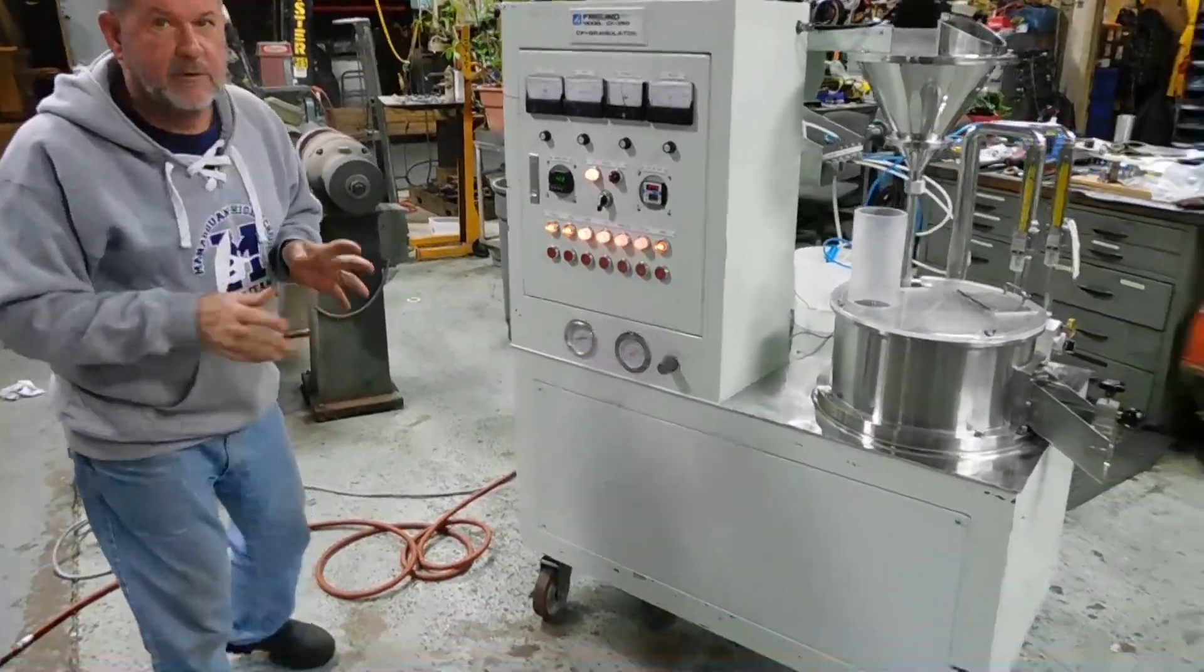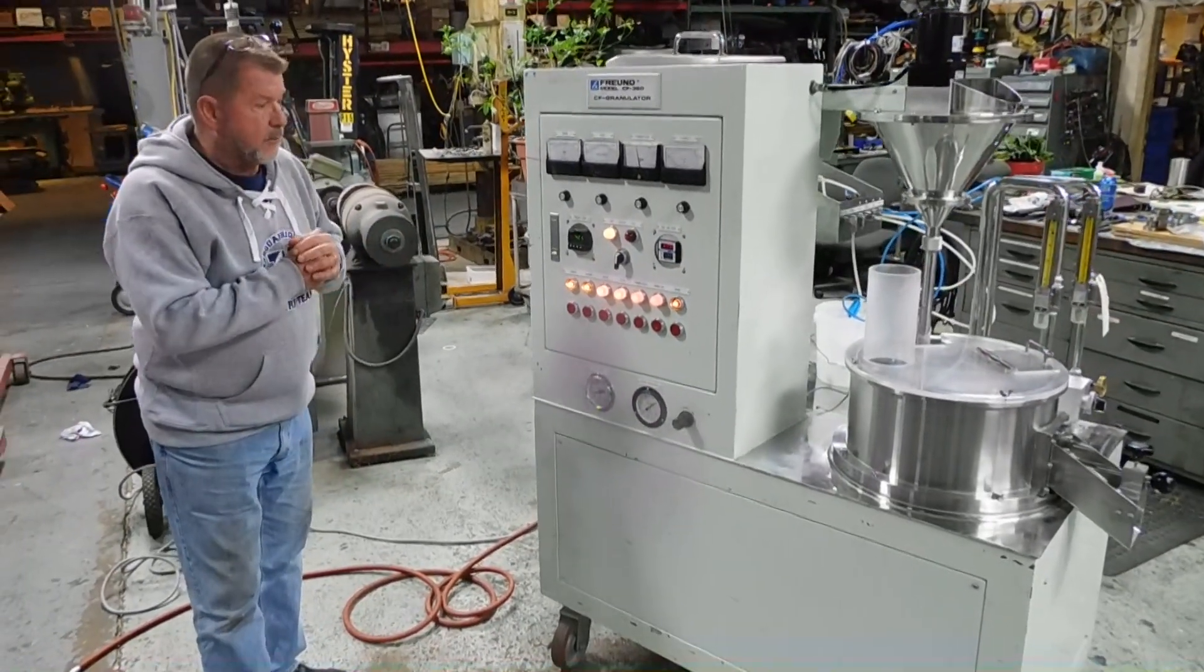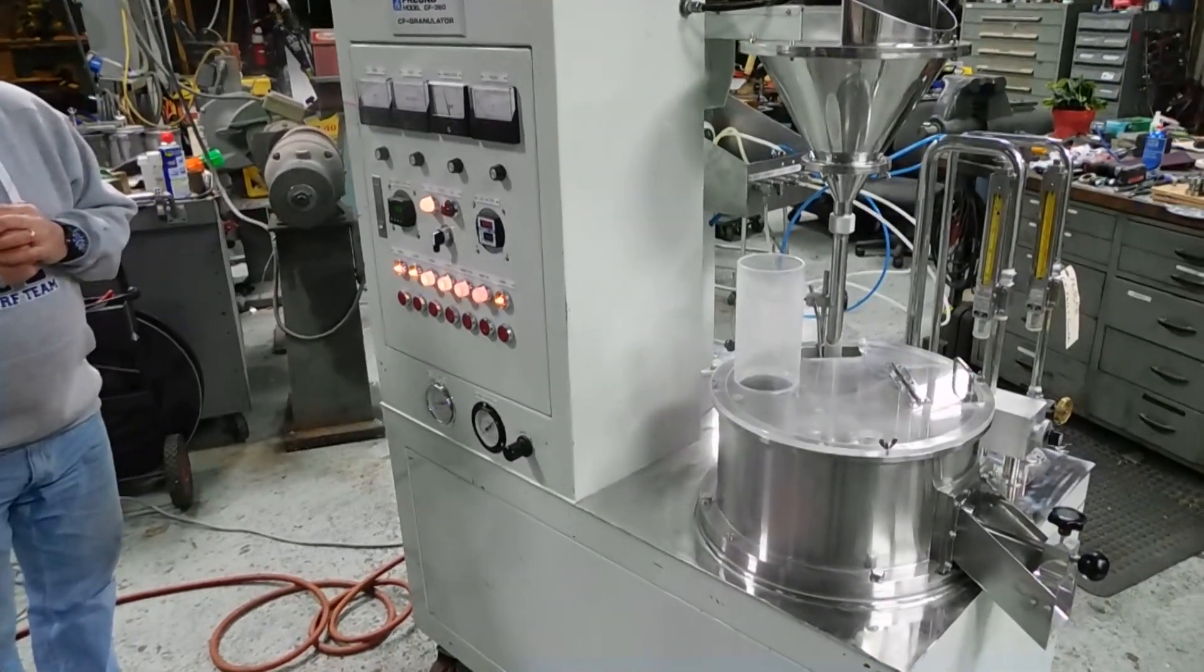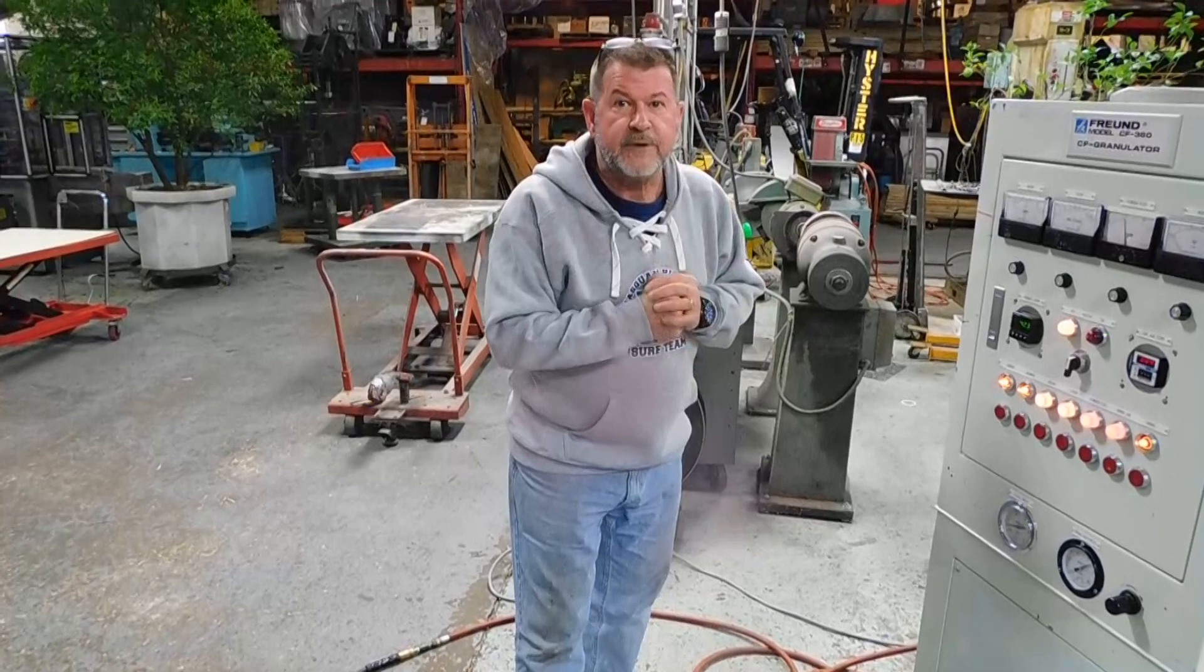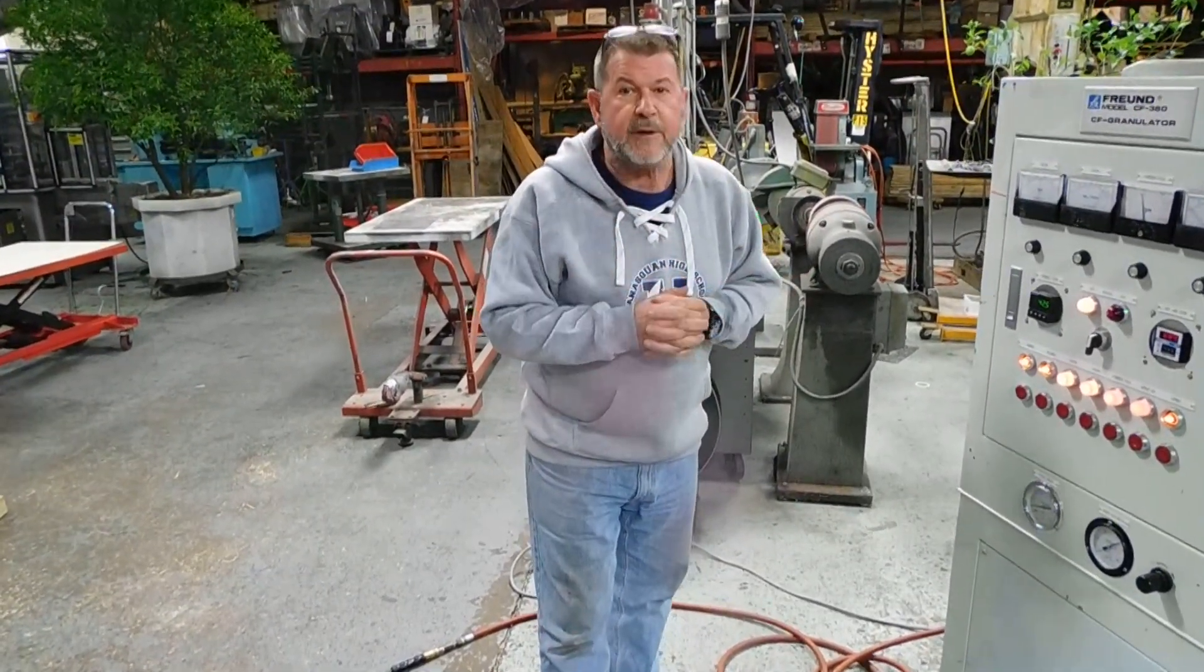I hope this helps you get a clear understanding that the machine's completely operational, everything going, and I'm quite sure there's factory support for it. I hope you're visiting our YouTube channel and our website at champtrading.com, and we look forward to hearing from you. Thanks for joining us for the video today.